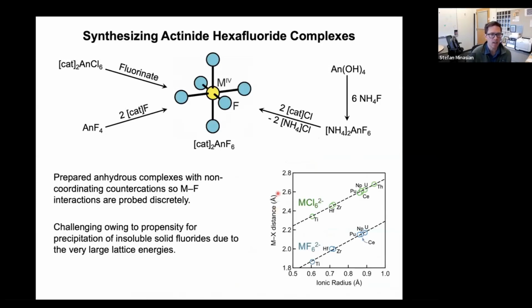Suffice it to say that even though these are very basic molecules, we did quite a lot of work to try to make sure that our analytes were really optimized for the spectroscopic studies, in particular by having non-coordinating countercations and by eliminating sources of water, which would normally hydrogen bond with the fluorides.